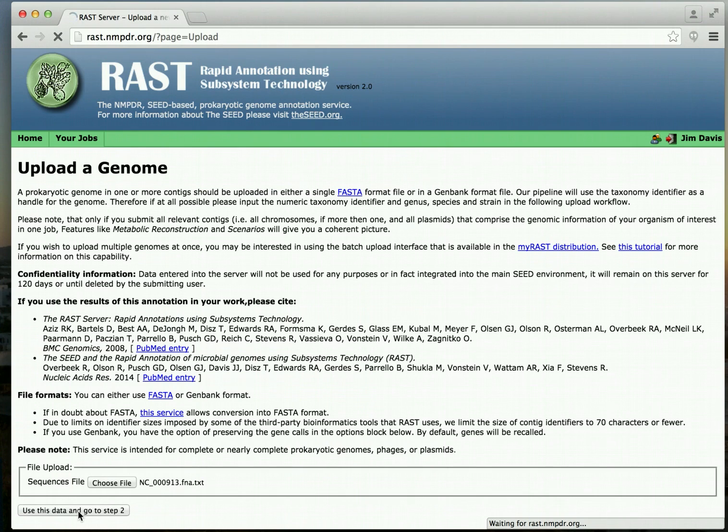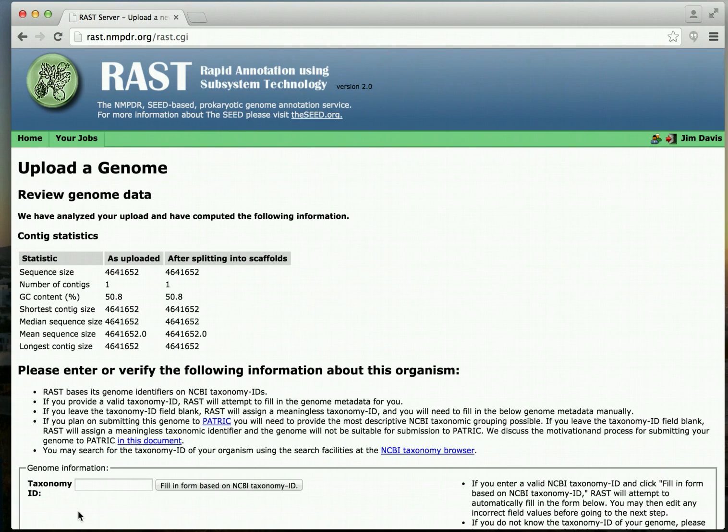The RAST toolkit is an exposure of all of the programs that RAST currently runs. We have recently exposed all of the tools so that users can attempt to create their own annotation pipelines.